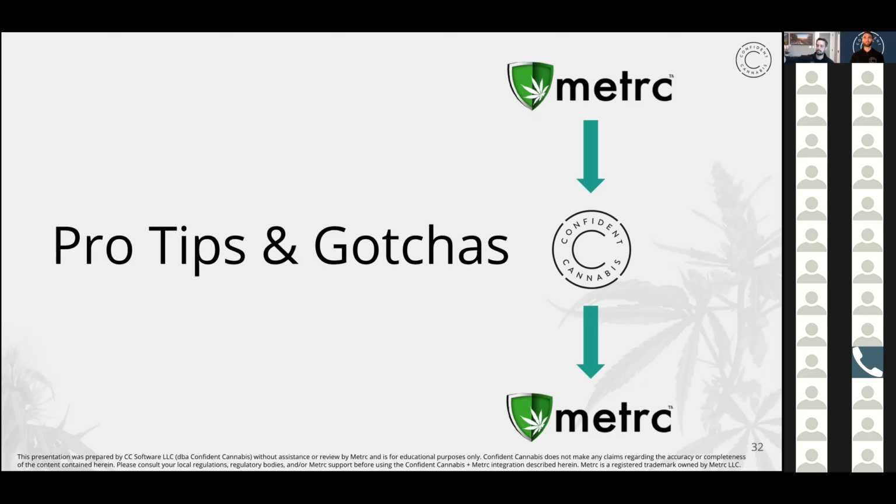So you don't need to tag it again at your lab, unless you want to, in certain rare scenarios. You might want to do a subcontracting and send part of it to another lab, in which case you would have to create a child package. But most of the time, that kind of thing, I'm not sure if subcontracting is even legal in Oklahoma. In some places it is. And so you'll already have a tag associated with it. If for whatever reason you have material that doesn't have a tag, then yes, you should add a tag to it. But definitely check with Metrc support or your regulators to make sure that whatever it is you're doing is the right way to do that.